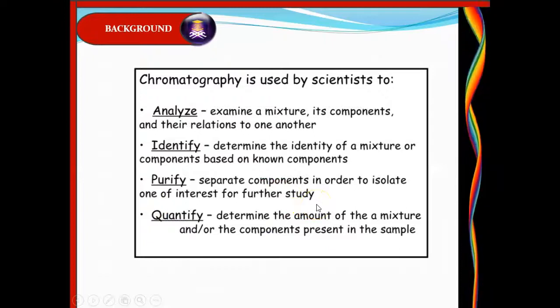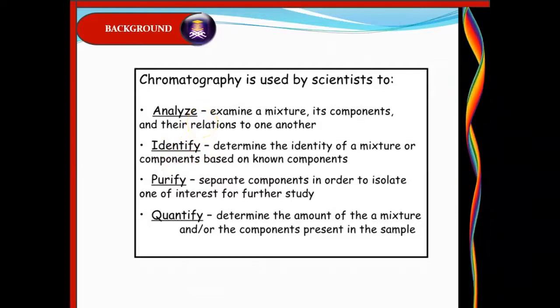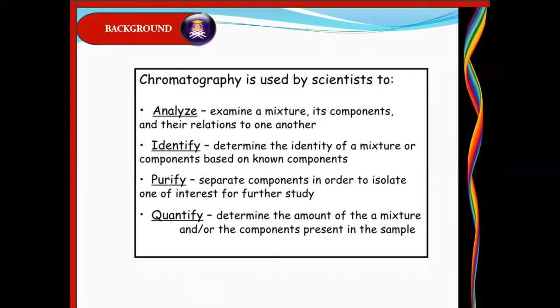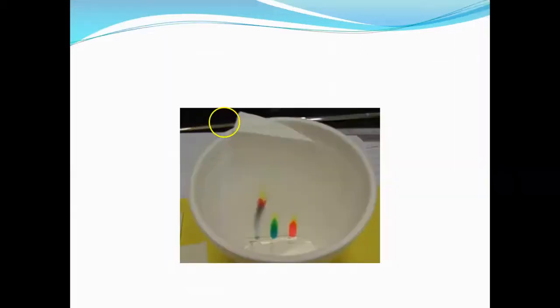Chromatography is used by scientists to analyze, which means we examine a mixture, its components and their relation to one another. We also identify, which is to determine the identity of a mixture or components based on known components. Next, we purify to isolate one of interest for further study. And the last one, we determine the amount of the component present in the sample.